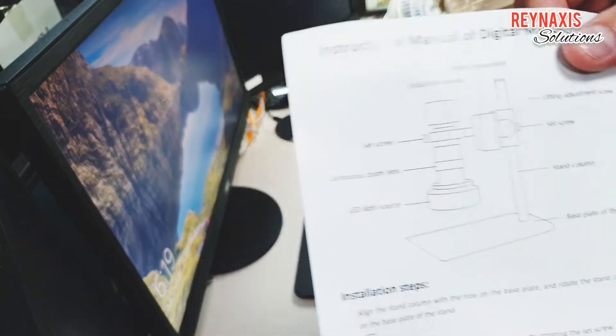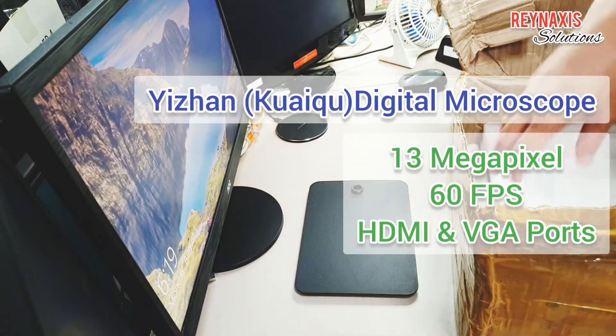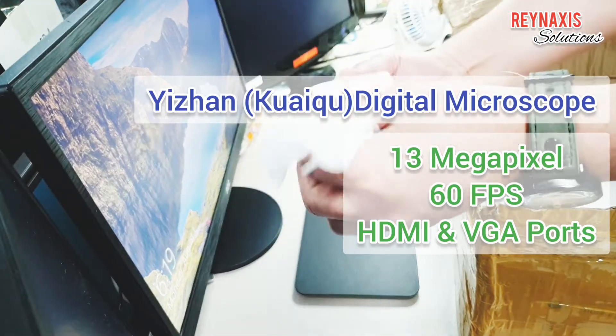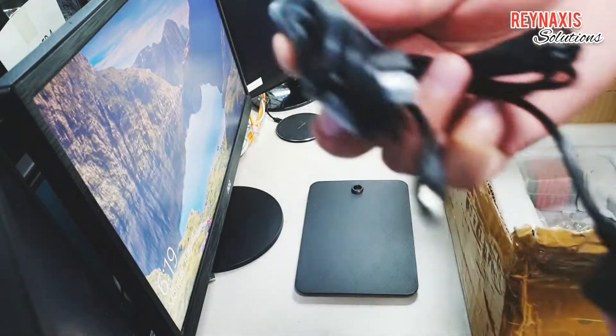I got it for P5,655. It did not come with an instruction manual on how to assemble it, so I'm just going to try and assemble it without a manual.